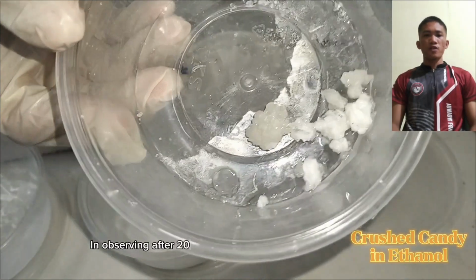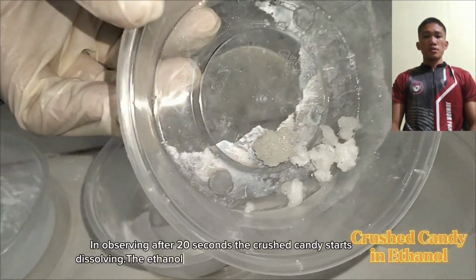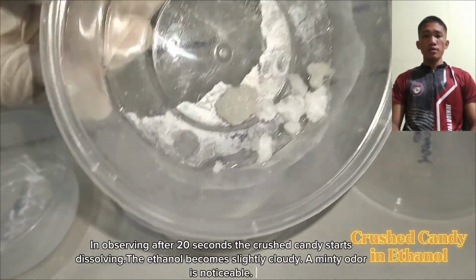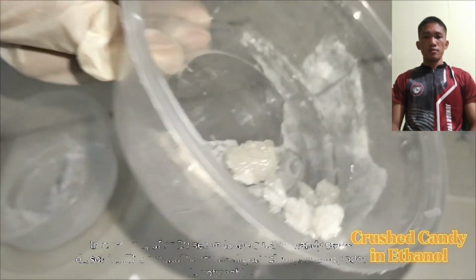In observing after 20 seconds, the crushed candy starts dissolving. The ethanol becomes slightly cloudy and a minty odor is noticeable.